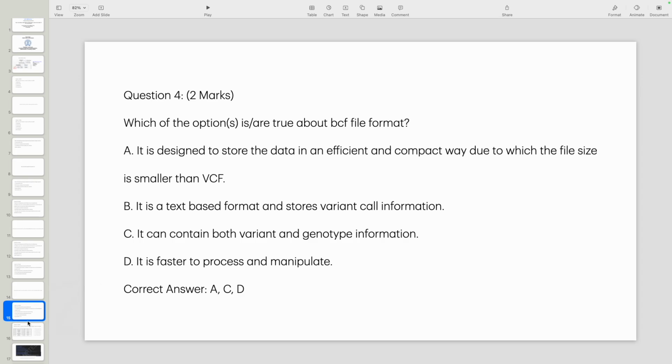We upload the VCF file, not the BCF file, for IGB, because there we see the texts.